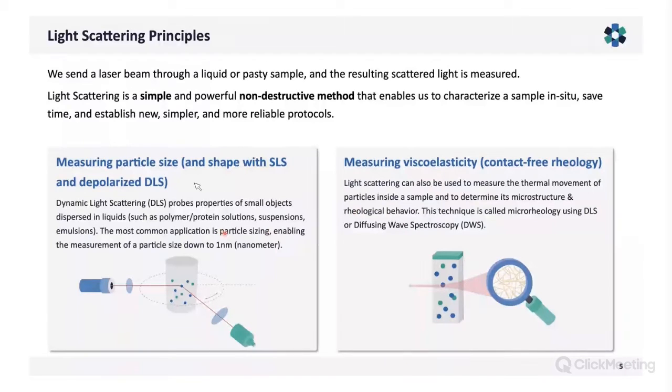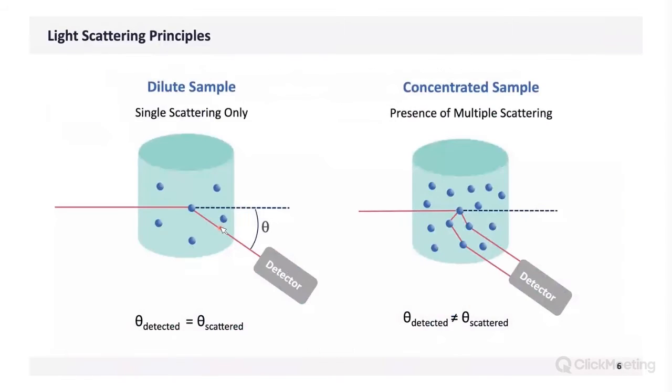So here I would like to focus on the general principle and the methods that we use in dynamic light scattering from such a system that is typically contained in a cylindrical cuvette that is 1 centimeter or so in diameter. The problem that everyone faces is that if you want to do such an experiment, you typically have to study singly scattered light.